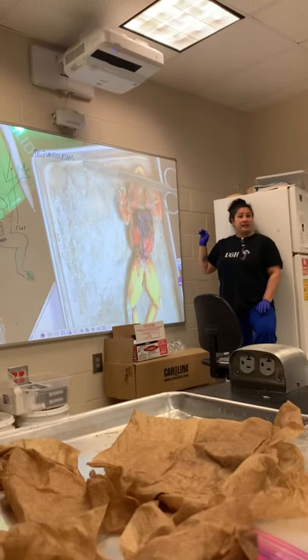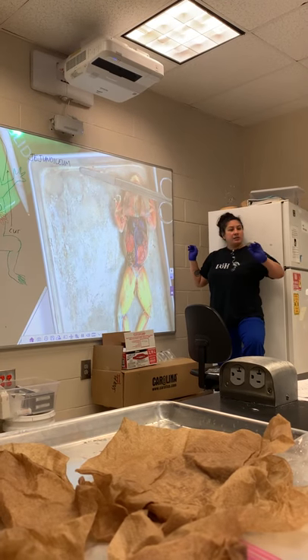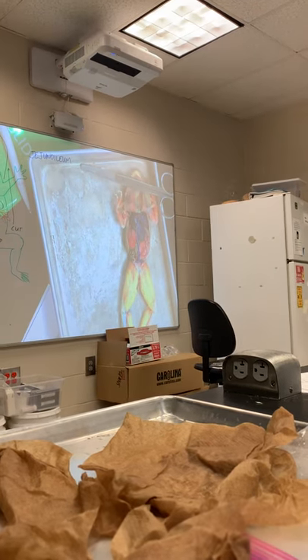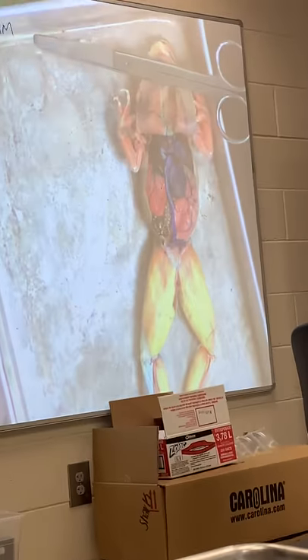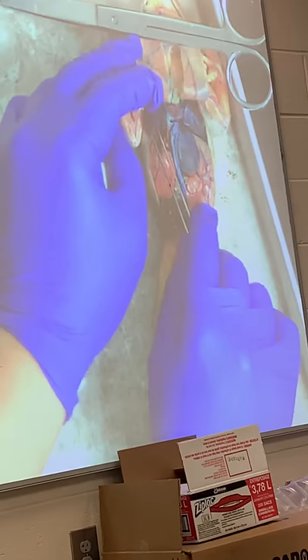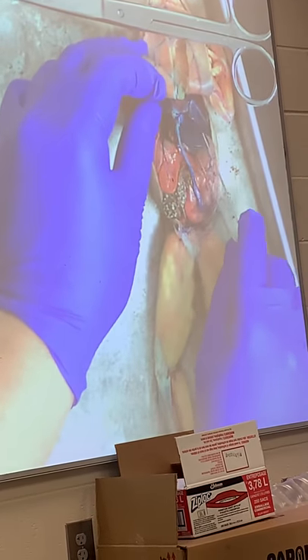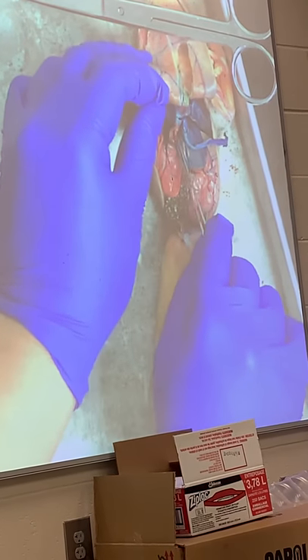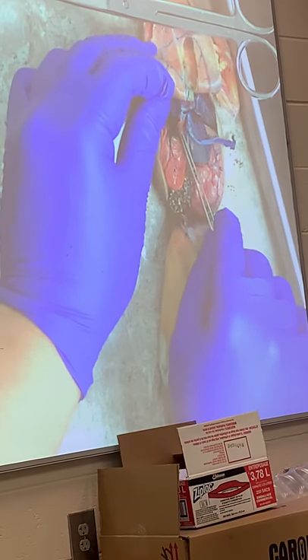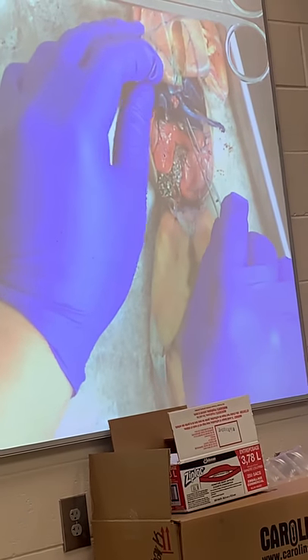Big lobes here — what do you think that is? The liver. Yes. So what I want you to do is with your frog, lift up the liver and identify the gallbladder. I have my right lateral lobe, I'm going to lift up my medial lobe, and I can see kind of between here there's this — it's red on mine, but it's usually a gross green color. This is the gallbladder. The gallbladder exists between the right lobe and the medial lobe of the liver.